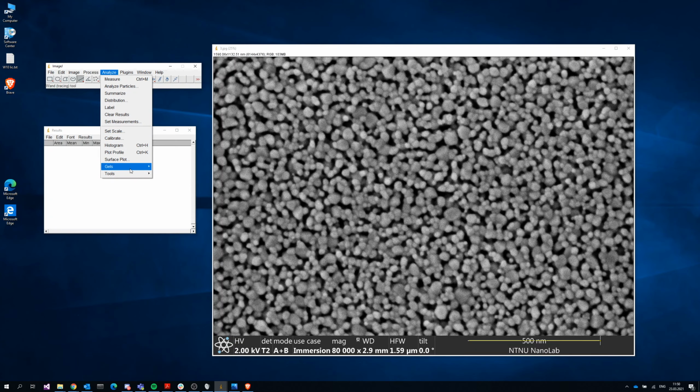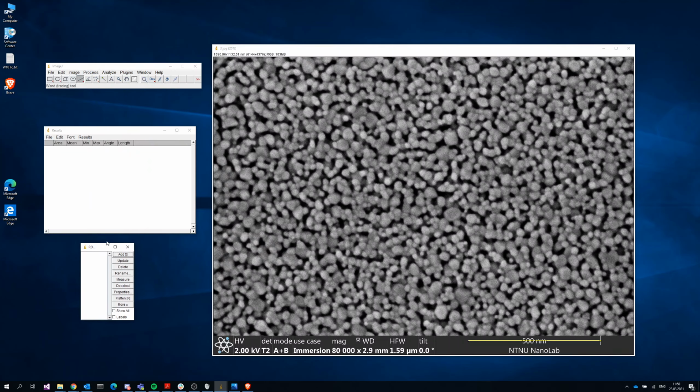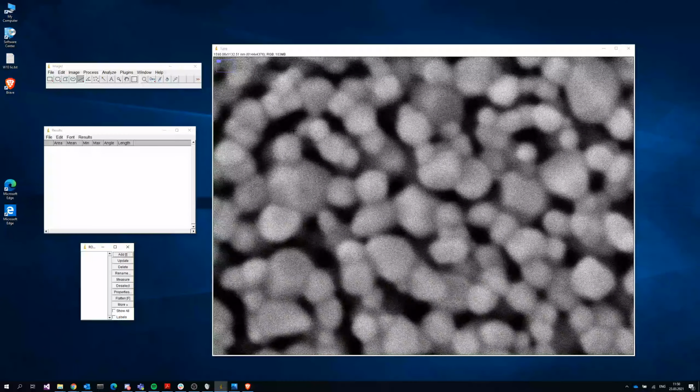The next thing you have to do is go to Tools and ROI Manager. This little window should pop up, and it's basically a data bank of every single unique measurement you make. The shortcut here is T. So we can zoom in on our image, make a measurement, press T, and it's added to this bank. And so we can keep going.